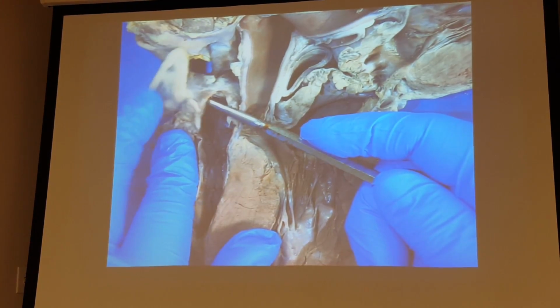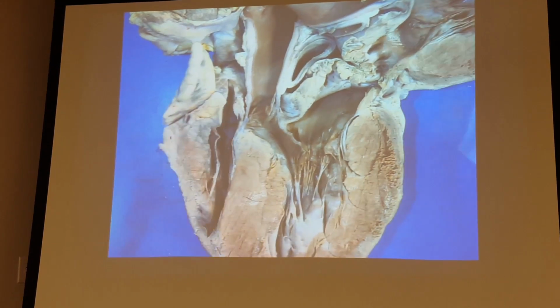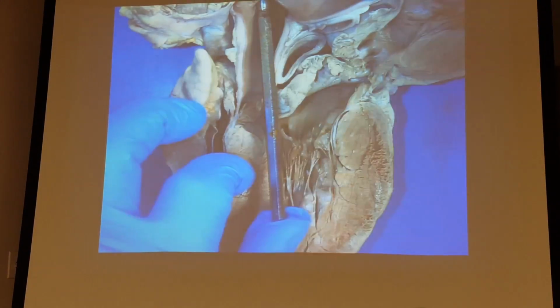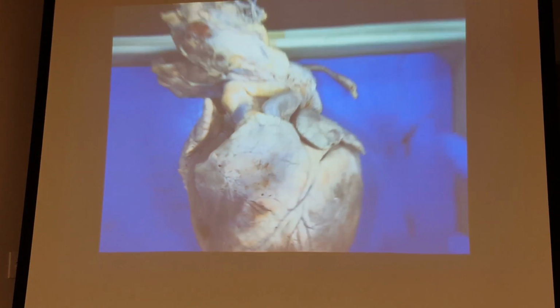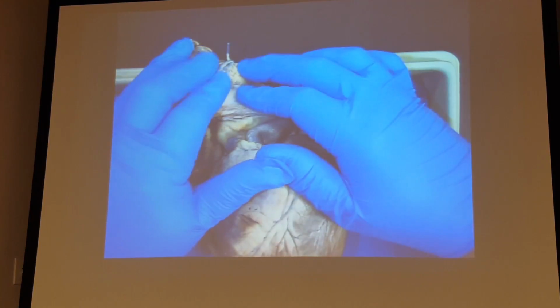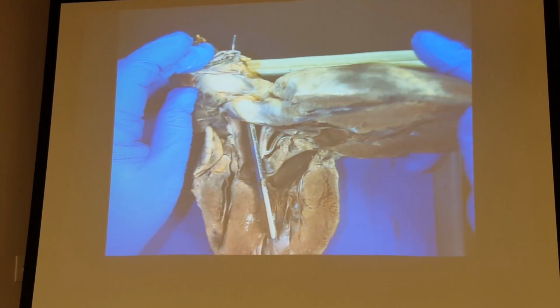Now everybody always wants to know where the aorta is, so if I pull this back, notice that the aorta is in tons and tons of fat. But see my little probe up there? My little probe sticking out the top. See, it's in the aorta.